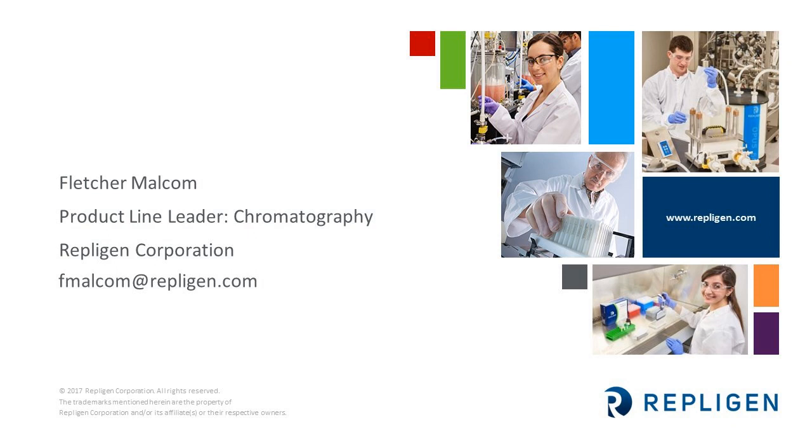Okay, great. Thank you, Fletcher. So the first question is, why might you see differences in small bench scale columns and larger columns for production, both for self-packed and pre-packed?